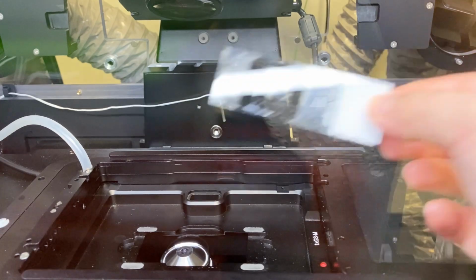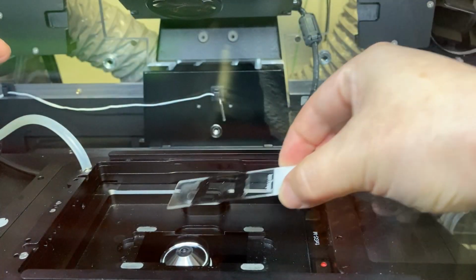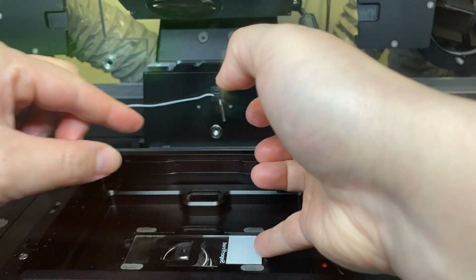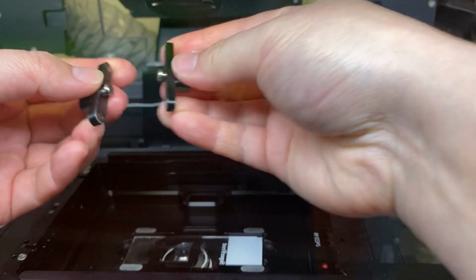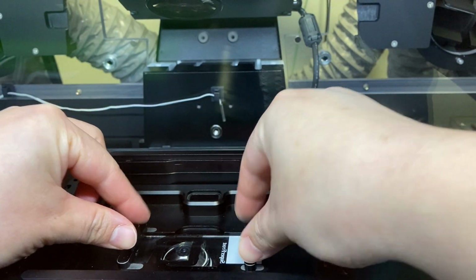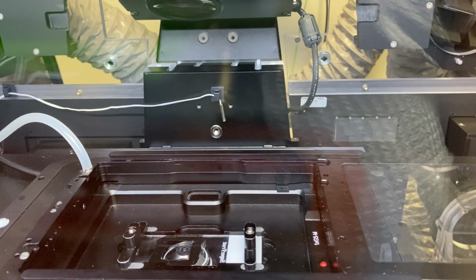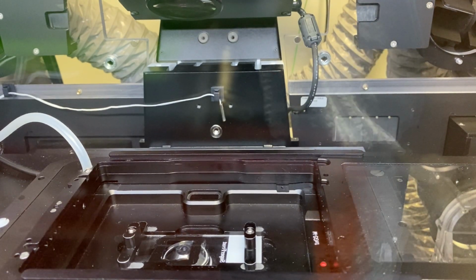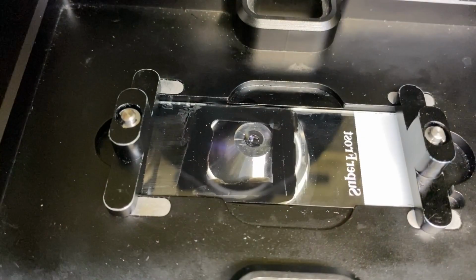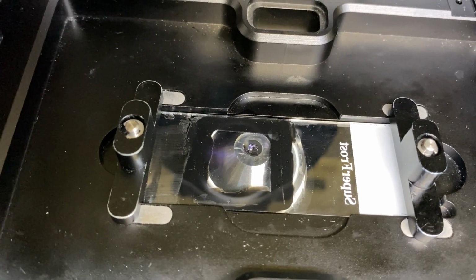And then you want to put your sample back. So cover slip side faces the lens. Push it back into the same corner and clip your sample down. And then you want to move your lens upwards until the oil touches the cover slip. Please don't look away from your sample when you're doing this. It's easy to miss.